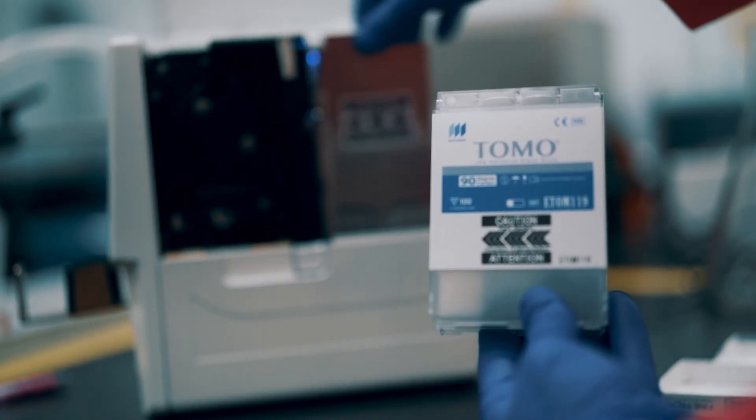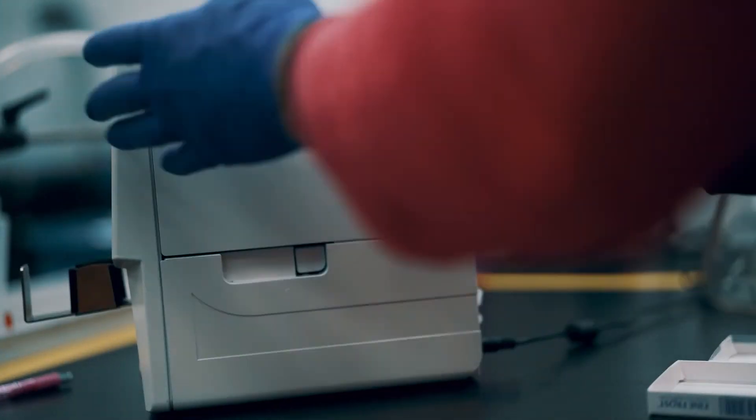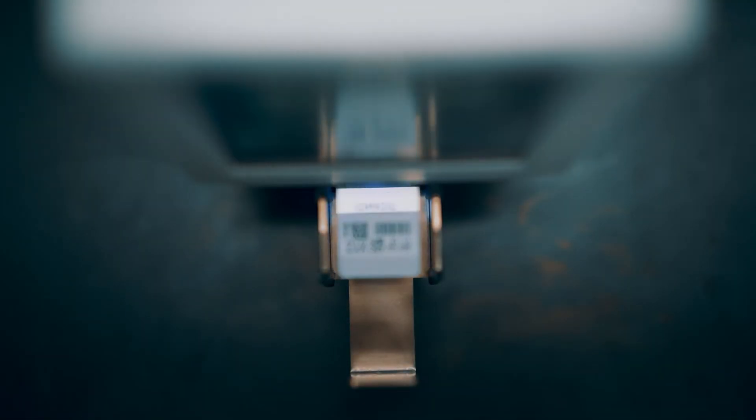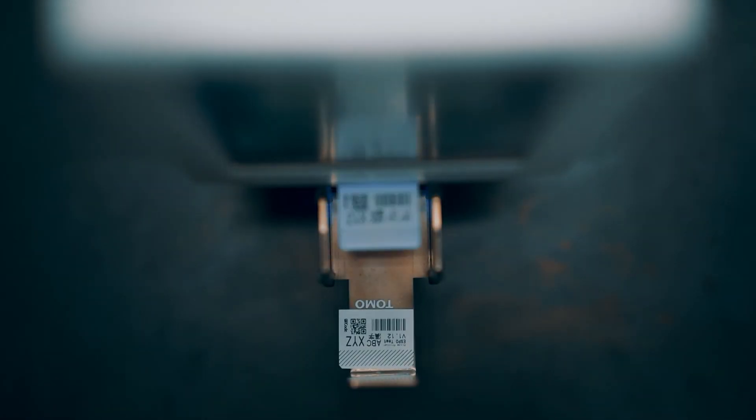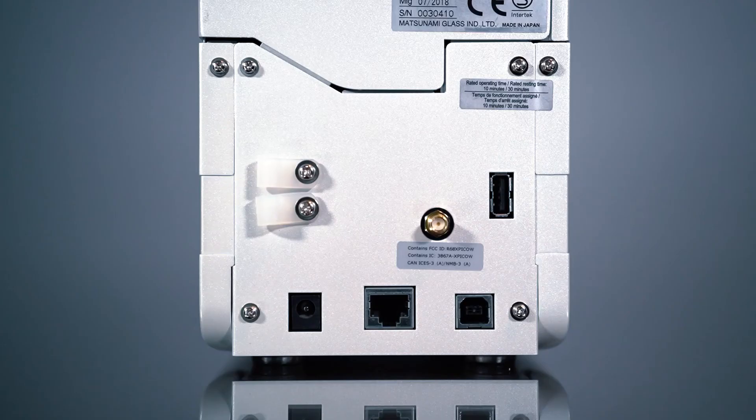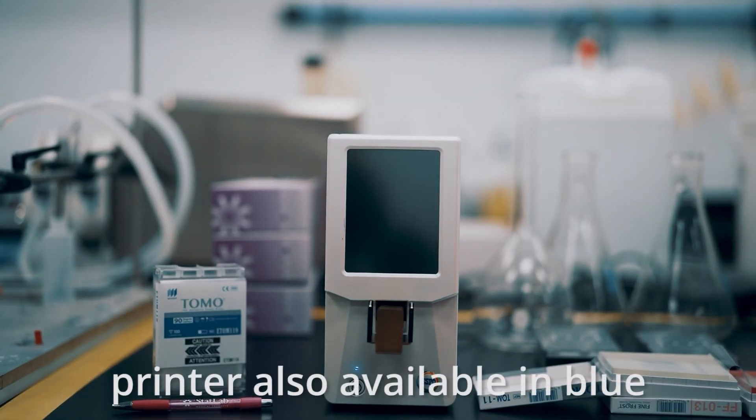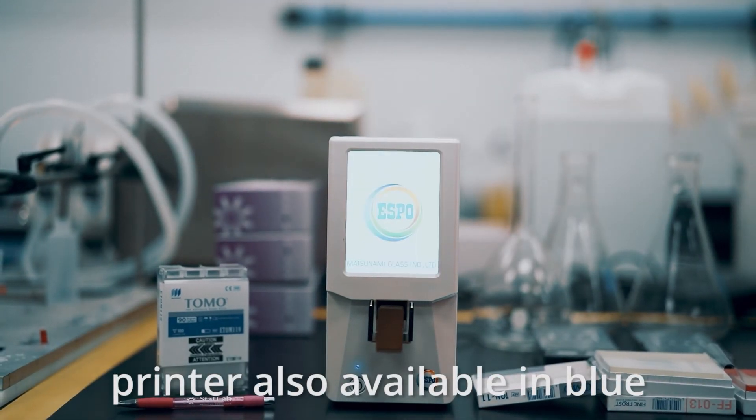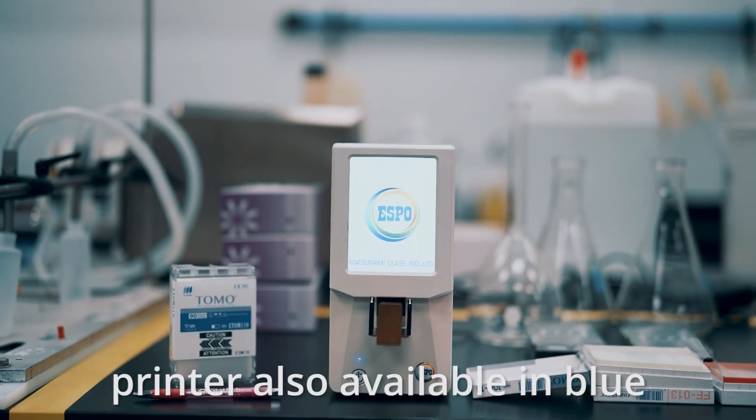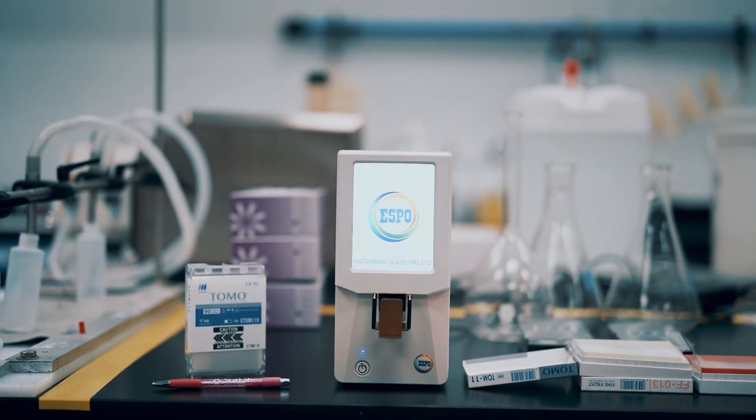preloaded cartridges for even more efficiency. The ESPO prints at 20 slides per minute to keep up with the busiest of laboratories and connects with Ethernet, USB, or Wi-Fi. Stop relying on handwritten labels for important patient data. Simple, flexible, powerful.